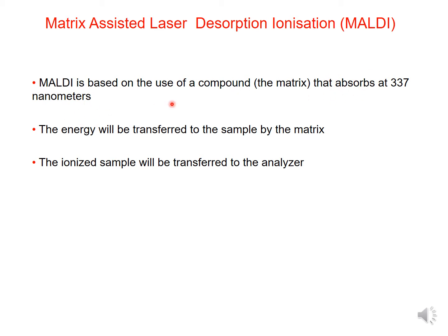If it absorbs this wavelength, it has energy, and the energy will be transferred to the sample by the matrix. That's the principle of the ionization. And then this ionized sample will be transferred after ionization to the analyzer.